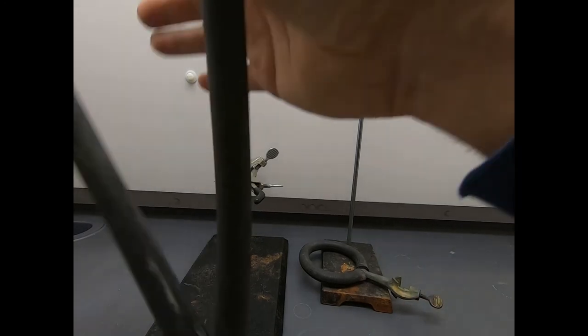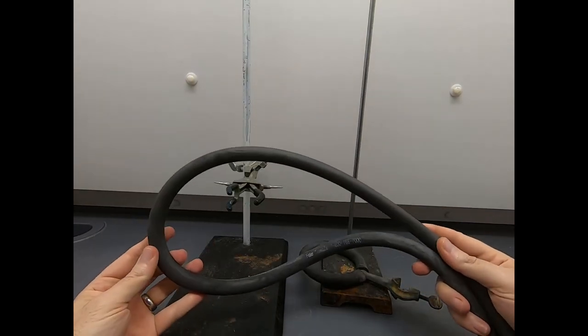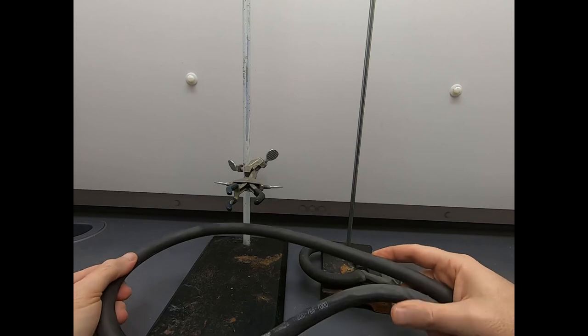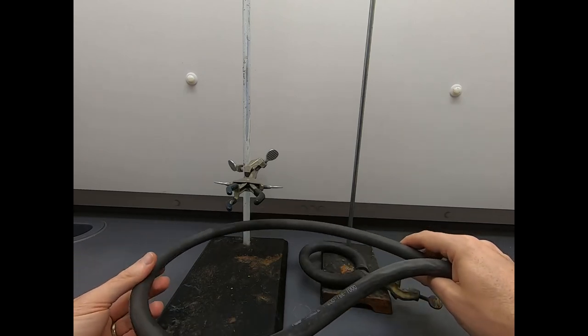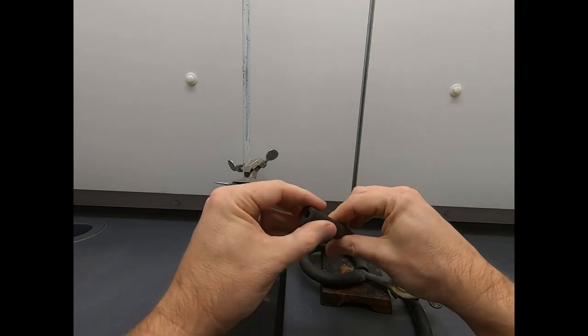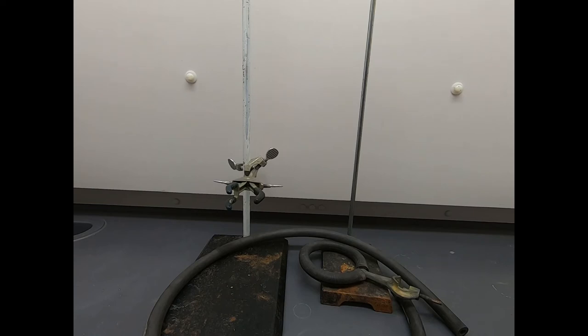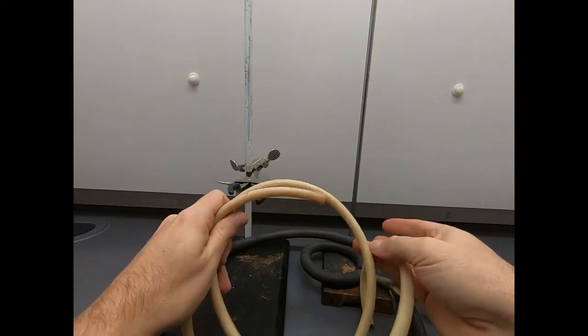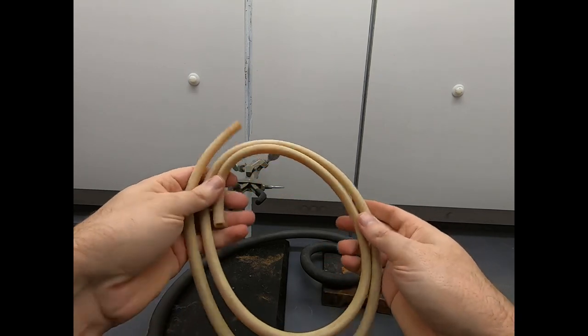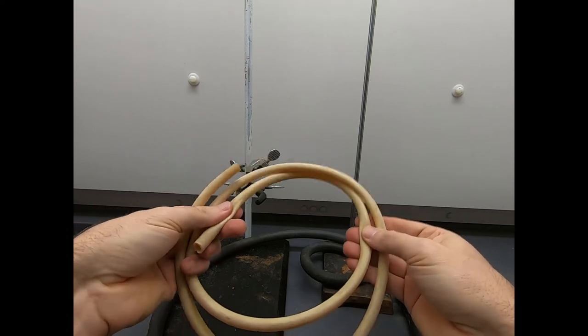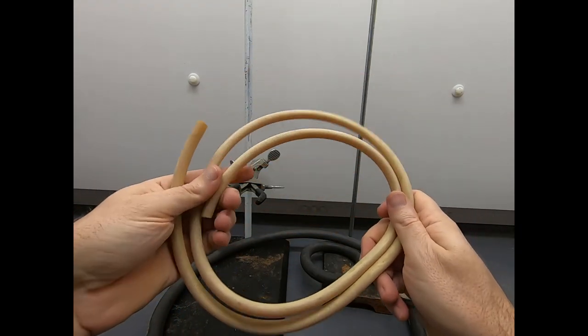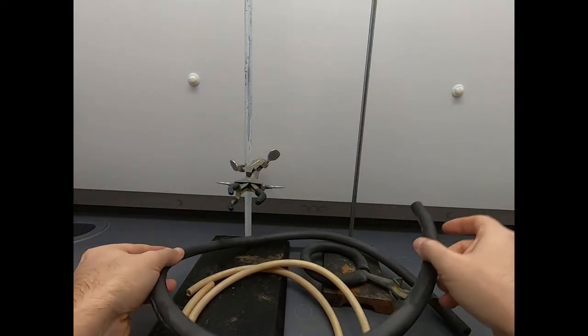In this clip, I want to talk about one other thing: tubing in lab. Tubing has different purposes. This is heavy wall tubing, vacuum tubing. This is suitable if you want to apply suction to something and you want to transfer the vacuum to your glassware. Doing a suction filtration, you would use this heavy black wall tubing. You can see that's pretty thick stuff.